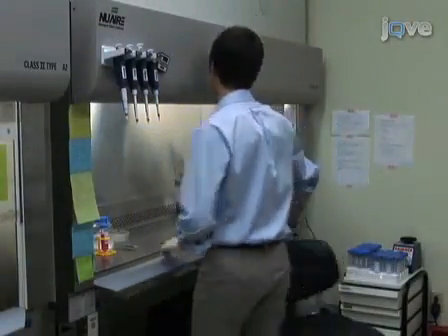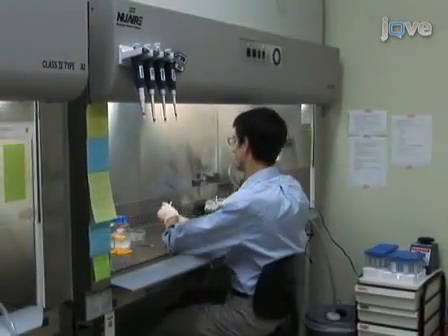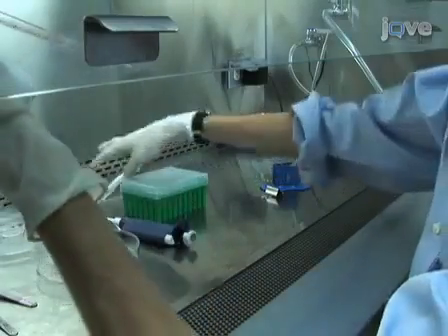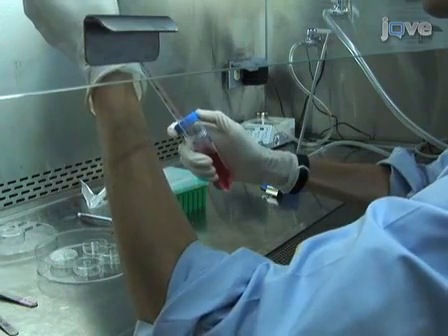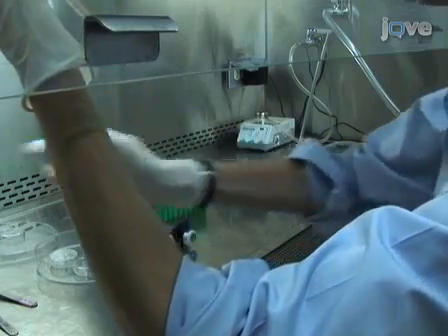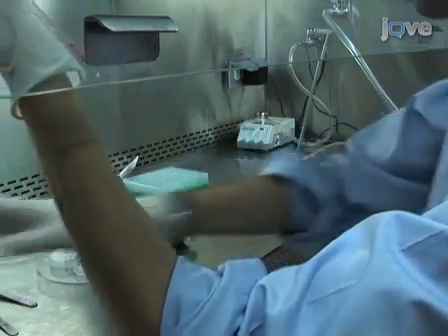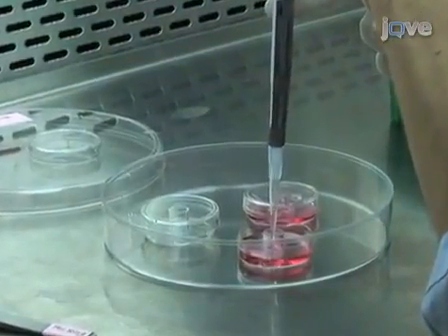Begin by plating dissociated adult mammalian neurons on cell culture dishes coated with 0.1 milligrams per milliliter of high molecular weight poly-L-lysine. This aids adhesion of neurons to the bottom surface of dishes. Glass cloning cylinders can be used to concentrate plated neurons in a smaller, more confined area to minimize the distance between neurons to be injected.